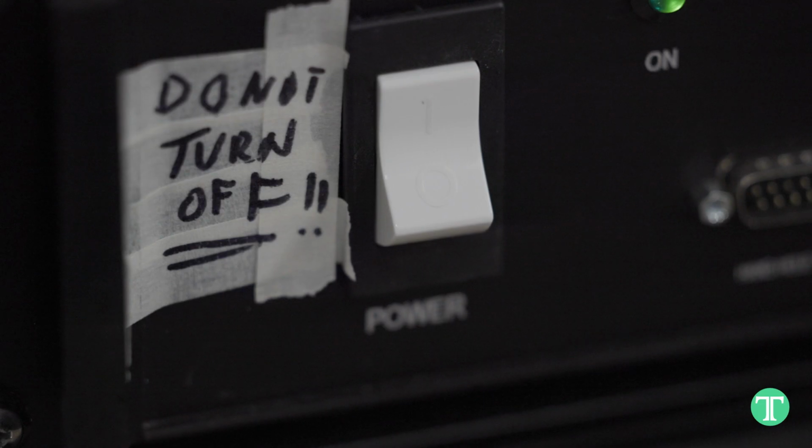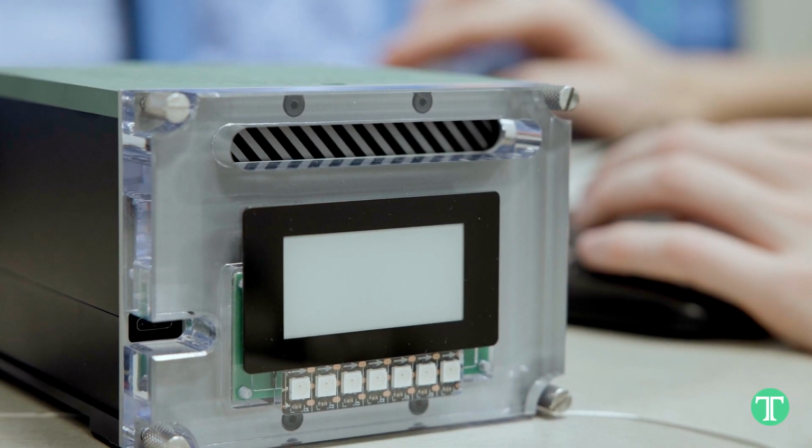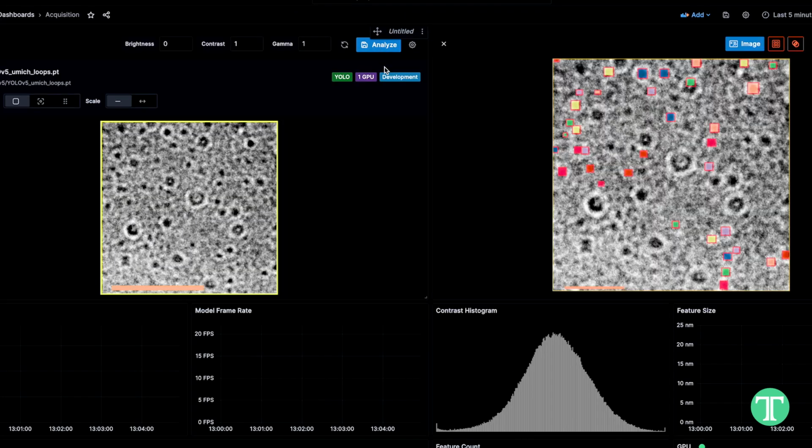It was painful. Now, fast forward, we can do that analysis using the machine learning tools that are available through Theia Scientific. It'll give us that real-time feedback on how the material is evolving.